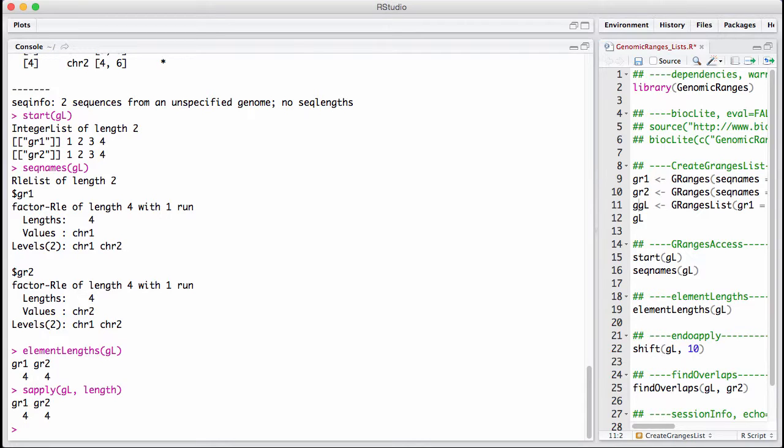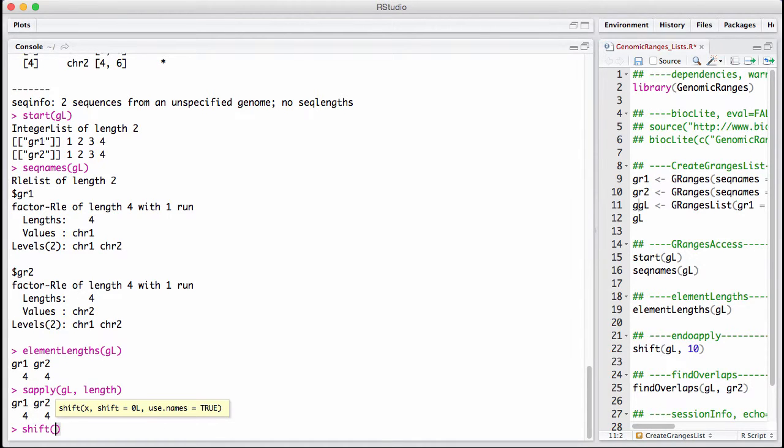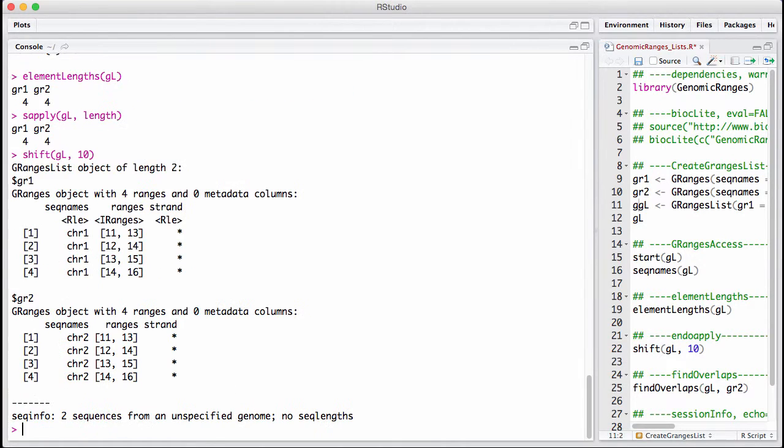There's something in gRangers that is being introduced that are called EndoApply. And EndoApply has a fancy name for a very simple operation. It's applying a function to a gRangers list that results in a new gRangers list. So there's a lot of standard gRangers functions that we can use on gRangers lists. For example, we can shift everything by 10. And this is an example of an EndoApply. We take a gRangers list in and a gRangers list comes out.